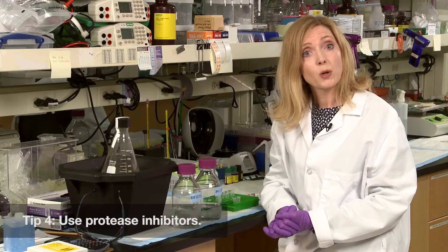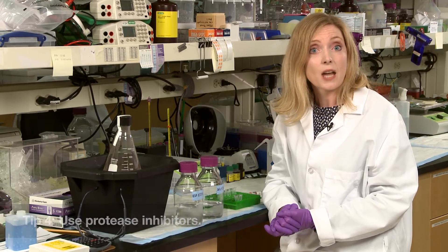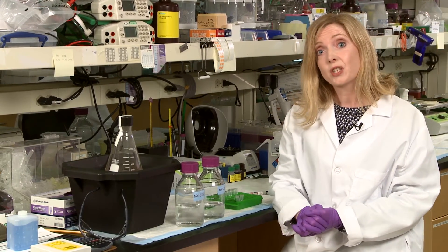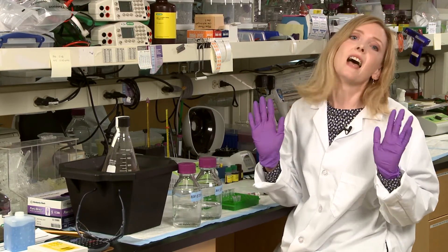Number four: you can also add chemical protease inhibitors to your buffer, like PMSF, EDTA, or pepstatin, or you could use a protease inhibitor cocktail. Follow these simple tips and your protein should be safe and sound when you run that gel at the end of the day.